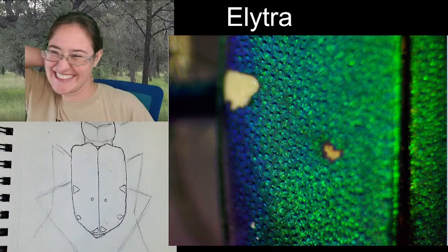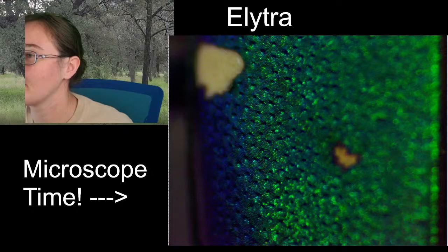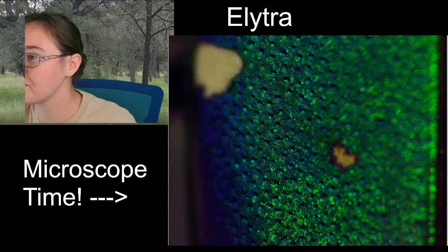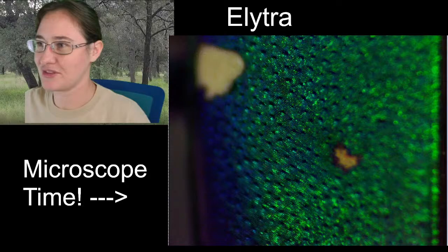I think that that's really pretty, though. We can actually go even further. I want to know if we... That's so cool. I feel like there are small kind of micro punctations or little kind of striae, little lines inside of the, like around the punctations. They're very pretty.